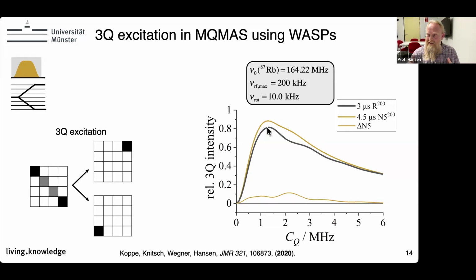So you can actually see the effects straight away, just in simulations, by using a shaped pulse with a shape parameter. With this WASP pulse with a shape parameter of 5, you simply press more of the power into where you actually want it. It shouldn't leak out of the pulse.